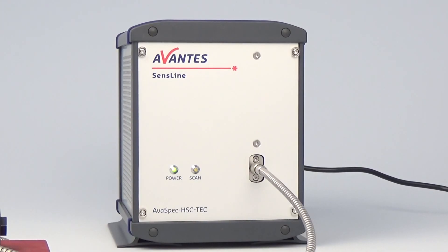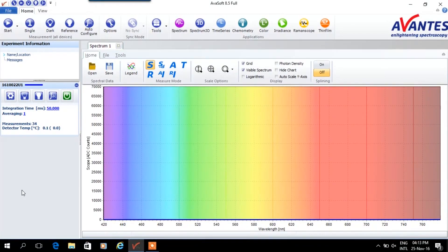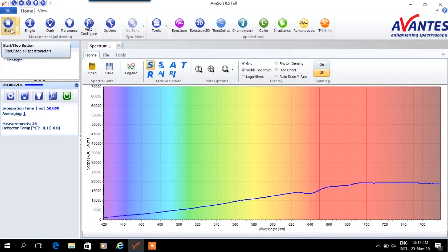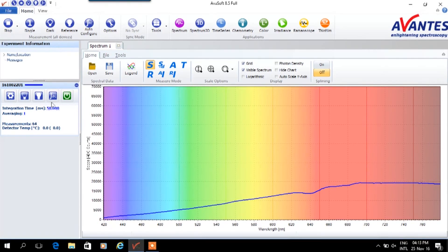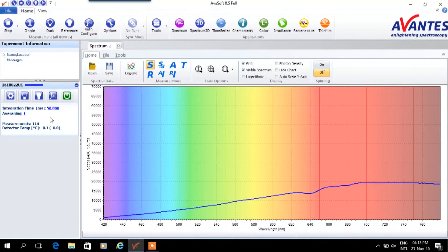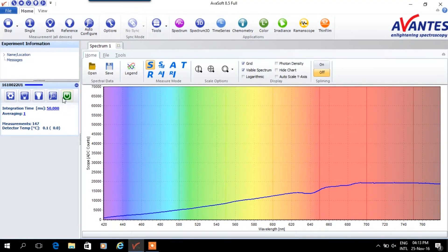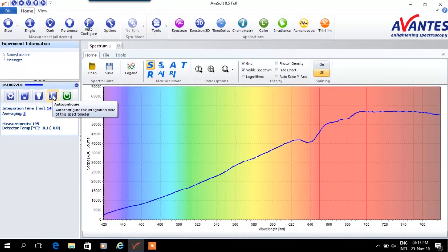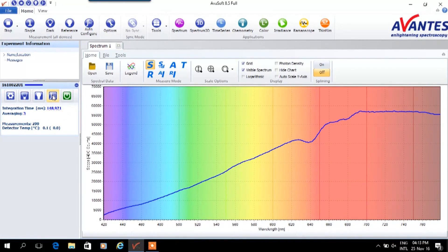The ArvaSpec Hero is used to measure the absorbance signal accurately. To perform the measurement we use ArvaSoft 8. After starting ArvaSoft 8 we press start to begin measuring and set the optimal measurement parameters. To do so we need no sample or clear in place and the light source switched on.